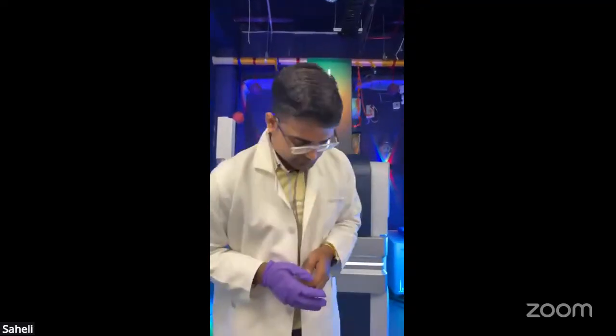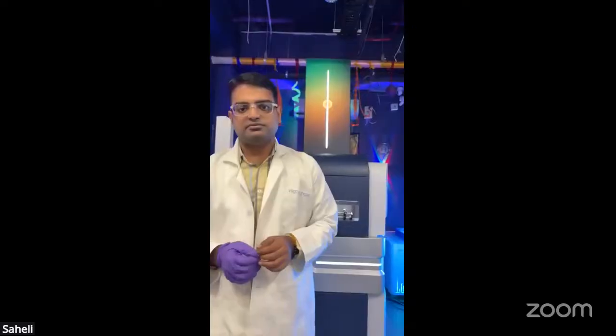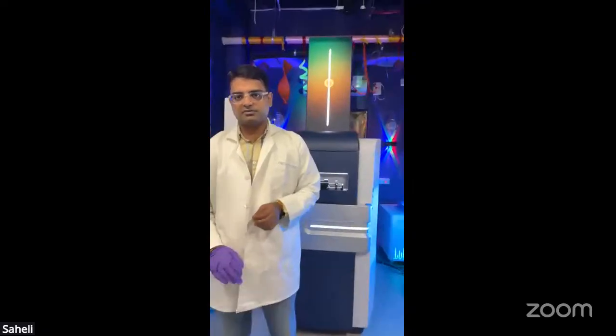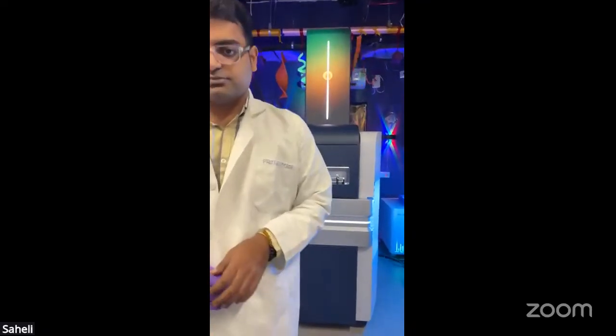Back to you, Professor. All right, thank you, Arya, for giving an overview of this technology. Again, a lot of experiments are happening. We are trying to utilize the potential of this technology for deep proteomics and quantitative proteomic analysis. Let's move on to the last section, the data analysis part, because data analysis is very critical at the end. Many of the students or participants of the MOOC, if they want to analyze mass spec data at home using their laptops, how can they do that? There are some new open access software coming up, like FragPipe or MSFragger, which is quite easy to use on your PCs.